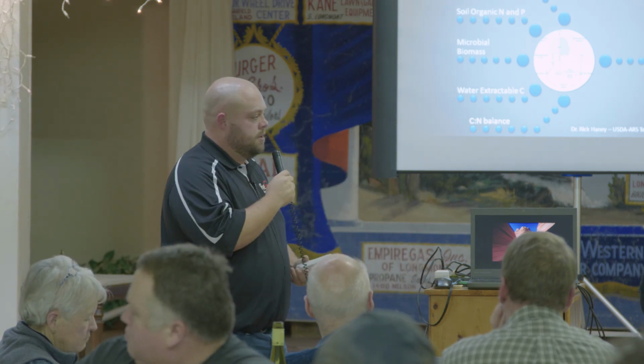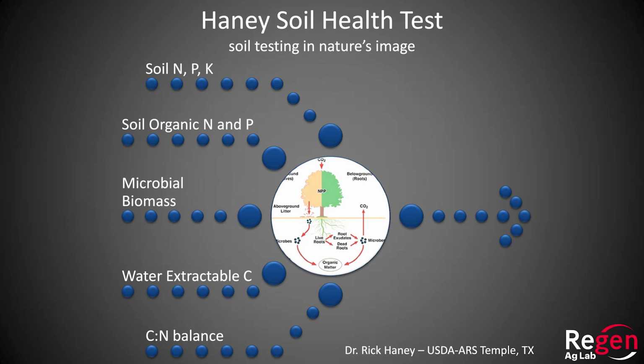So now I'm going to get into the Haney test. And this will be a lot of newer information compared to the individual consults. PLFA is pretty easy to cover. The Haney test is a lot more in depth. There's a lot more going on. So I'm going to break it down into these components.